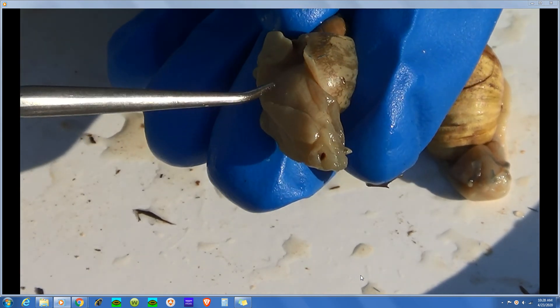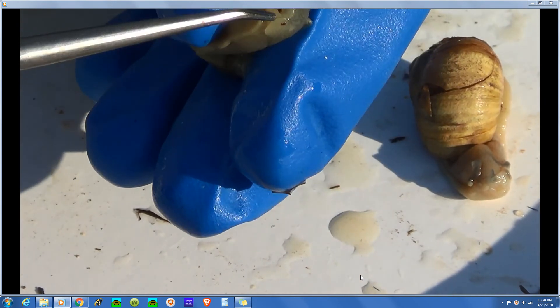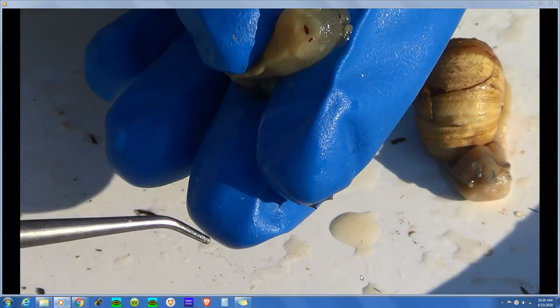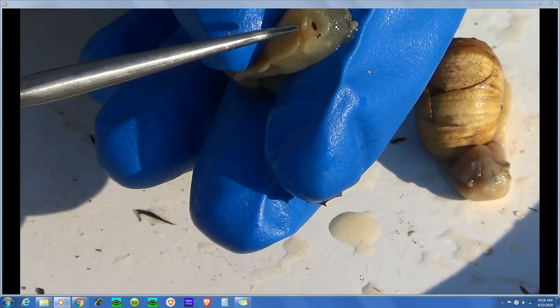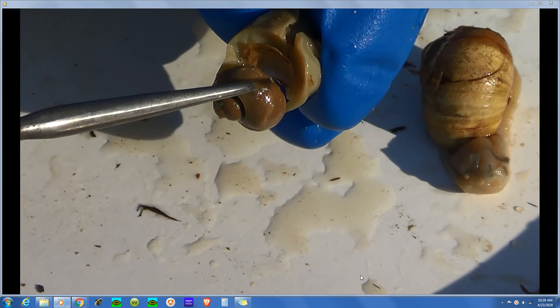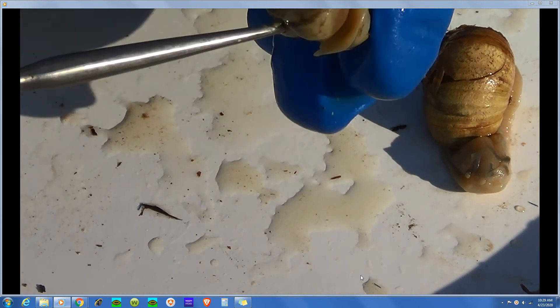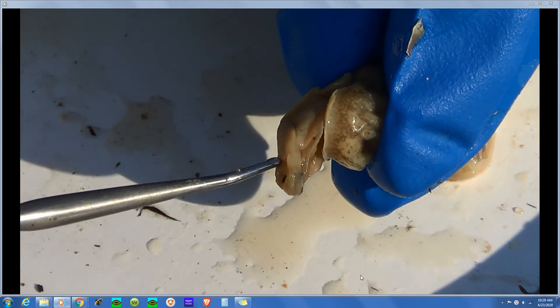This is not a filter feeder like the clam was — this is an algae eater. If I look over here I can find the mouth; you can see a little dark spot there that would be the feeding mechanism of this animal called the radula. It uses the radula to scrape algae off of rocks or whatever. You can see that the visceral mass of the animal has coiled following the contours of the shell.